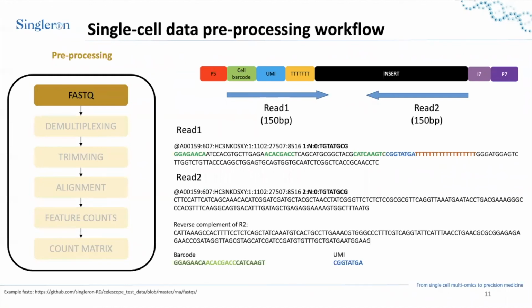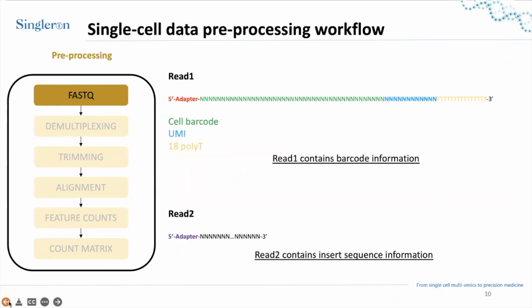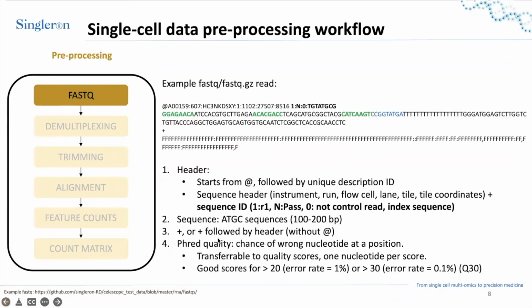I cannot say for sure, but I think it's a good question to check whether the quality scores are determined by the sequencing platform or sequencing companies. For example, if we re-sequence the same read again using a different platform, will we have different quality scores associated with this read?